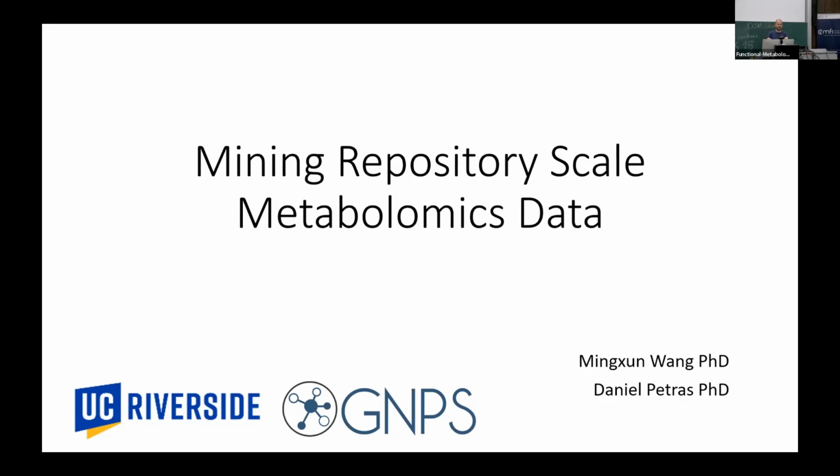So in the next hour or so, Ming is going to walk us through repository scale analysis, where we actually make use of existing data and either contextualize our own data or look for new patterns and new things right in the repository.